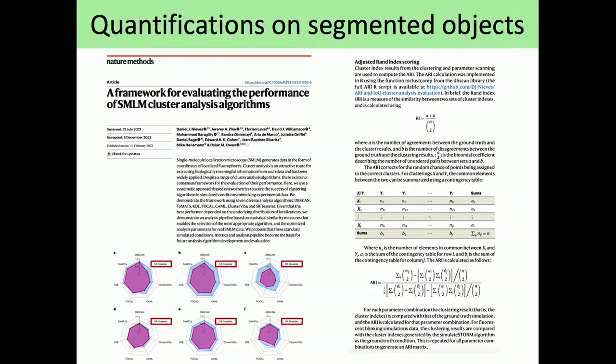So again, this is not your data. It doesn't mean that this will work for your data, but at least you can find out. For developers, that's a good tool. But also as a user, you can explore all the techniques which are available, because that's supposed to be living. New techniques will be added, similar to the paper I highlighted before for localization. And you can try to identify scenarios similar to yours, and then go in there and maybe explore some of the algorithms that could be more suited for your problem.